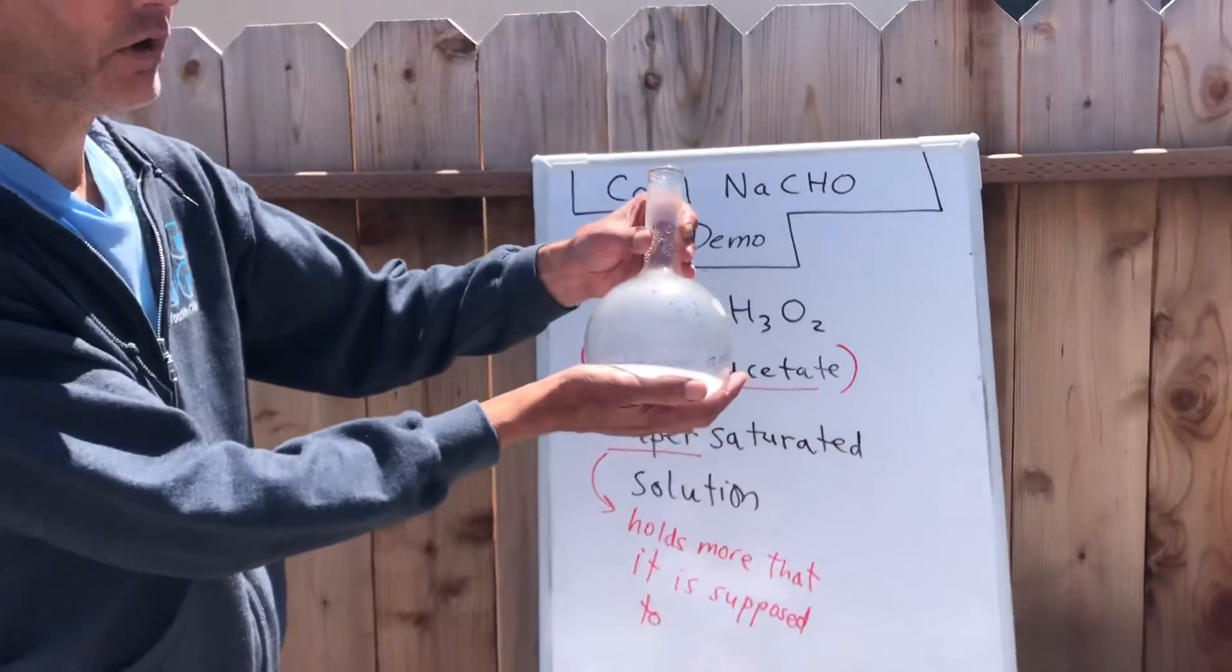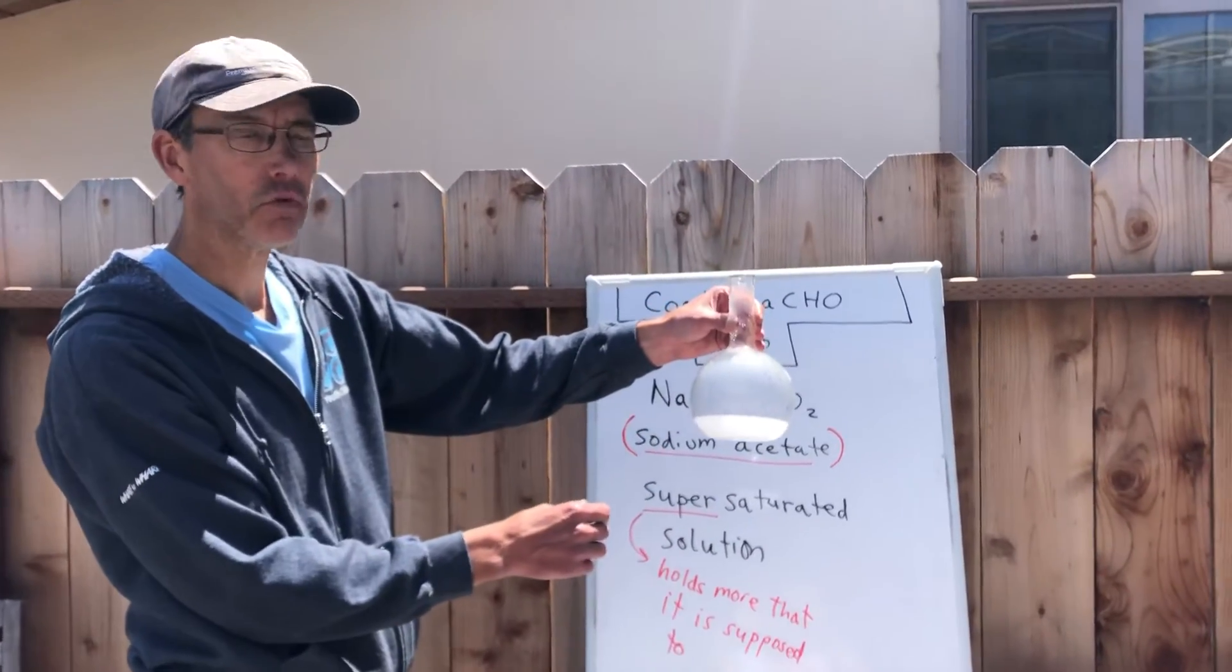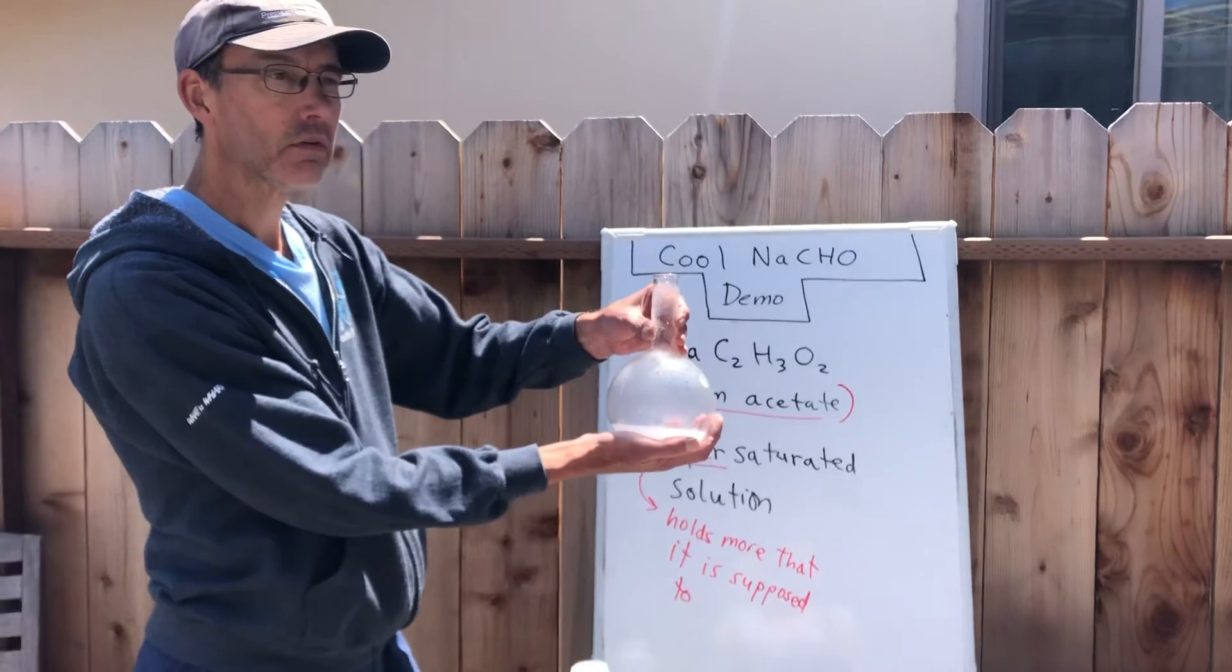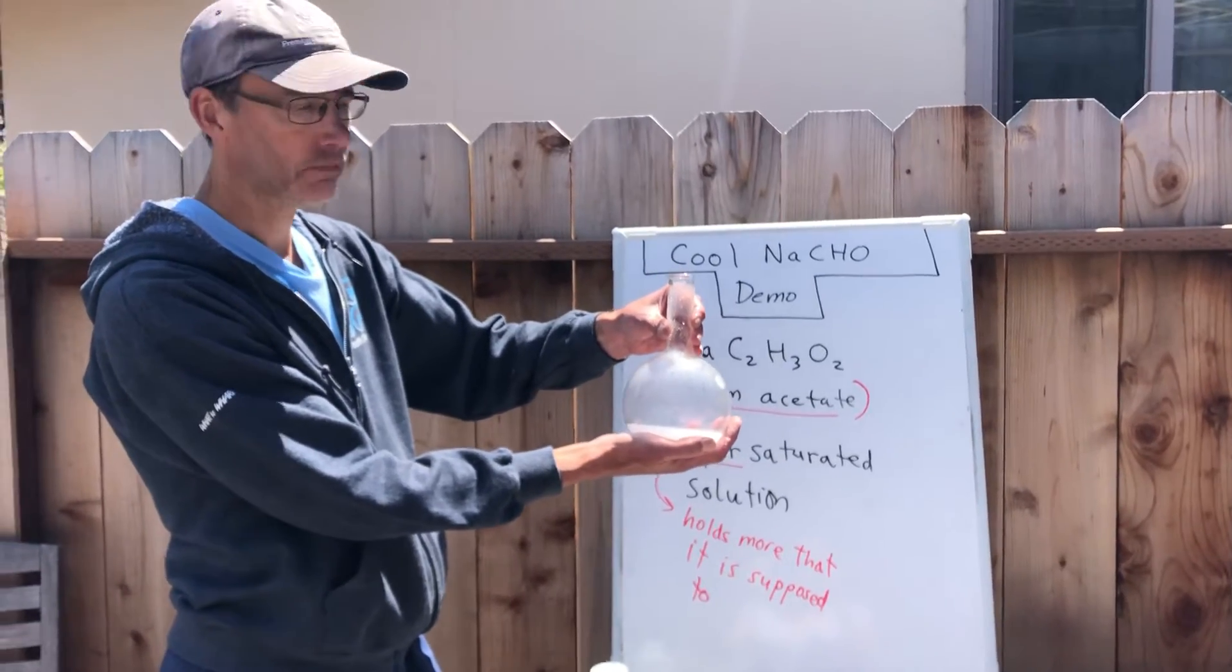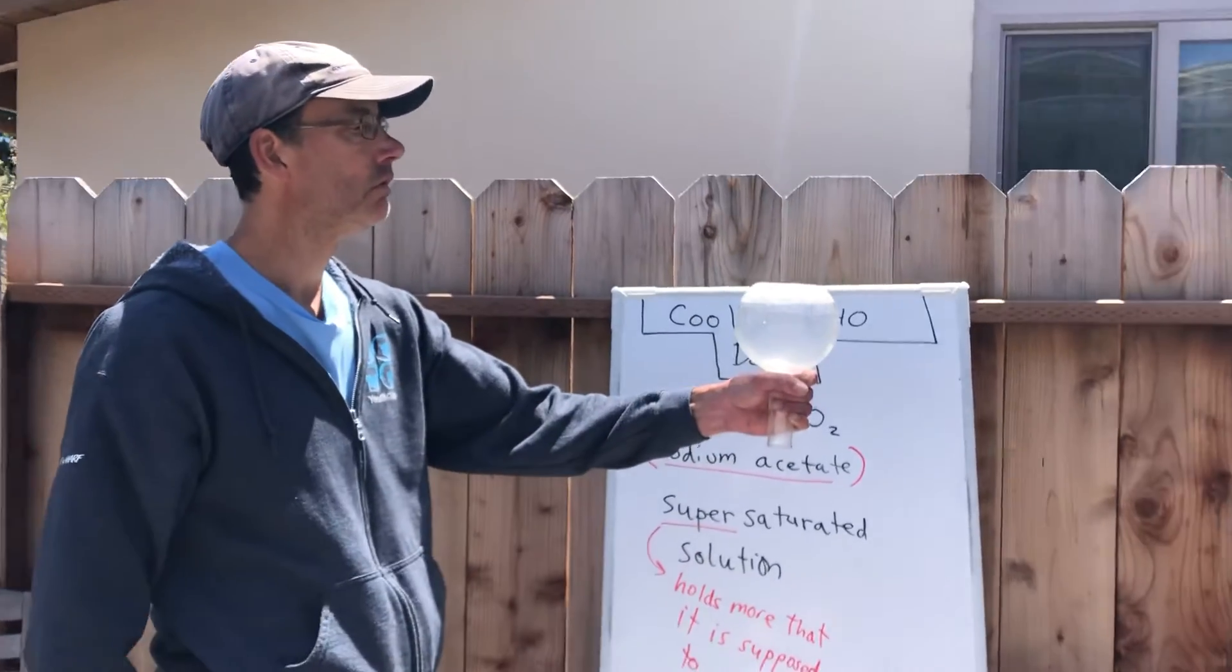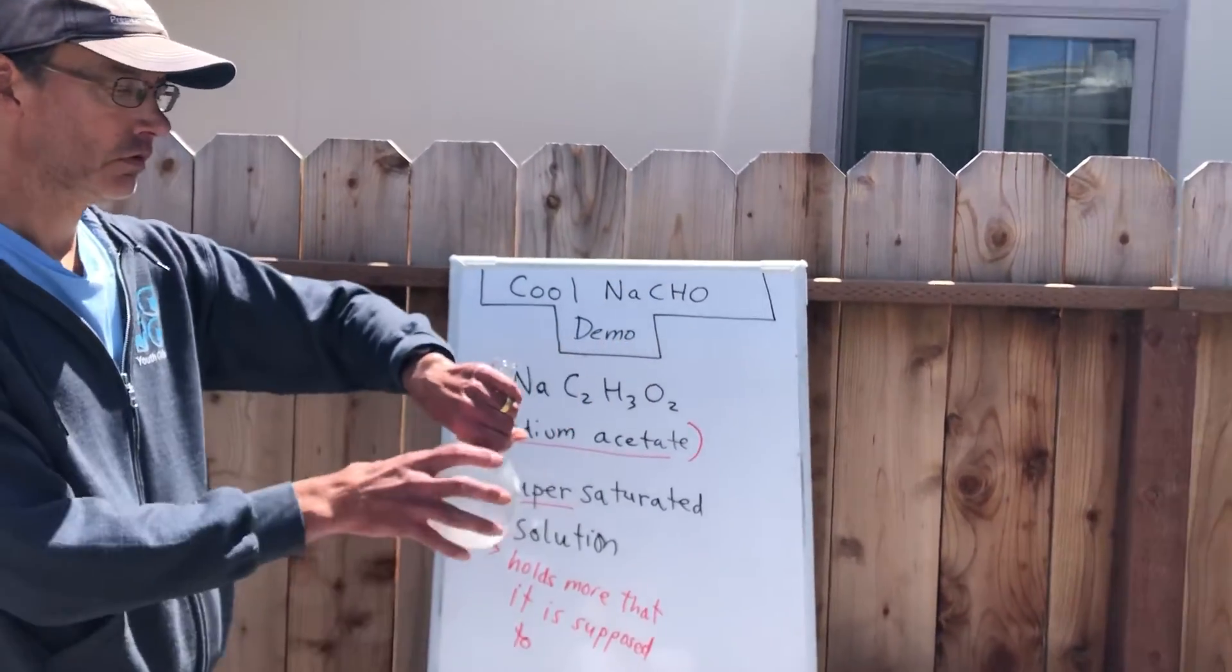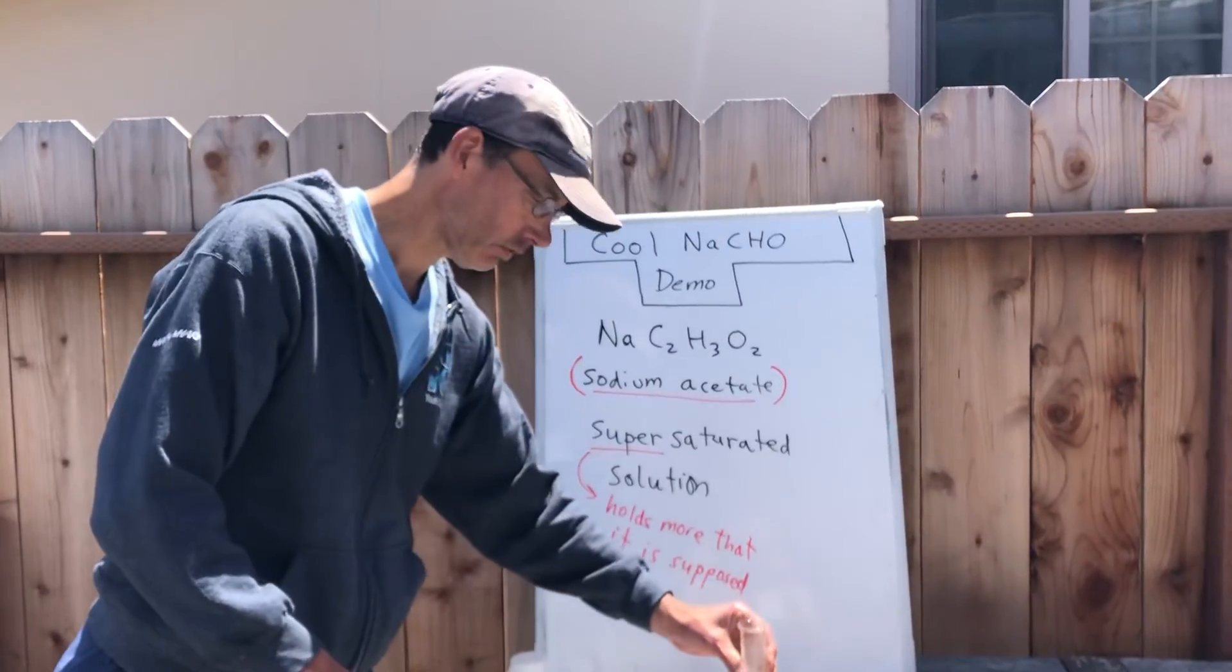And it's actually quite warm. It actually got warm enough to cause a little condensation to form inside there. So this reaction produced some heat. And it's completely solid now. So that's what happens to a supersaturated solution.